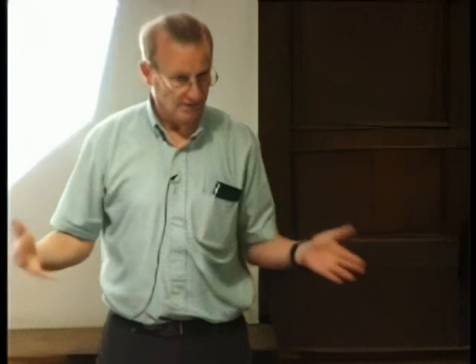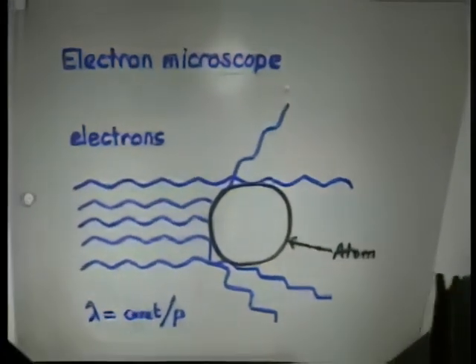And that is now, you see, the problem. That light waves, which are like 1/10 of a millionth of a meter in size, are much smaller than me, so I'm like the oil tanker. They scatter off me easily, and you can see me. But they're huge wavelengths compared with atoms. So they don't scatter off atoms, and the atoms are effectively invisible, like the little boat. So what you need to do is, instead of using the rainbow of light that our eye is used to, you need to be able to use light of very much shorter wavelength, wavelengths of the order or smaller than the thing you're looking at. Now, you can go into the ultraviolet region where the wavelengths are smaller, into the X-rays and gamma rays where the wavelengths are very, very small, and you can start seeing smaller and smaller structures.